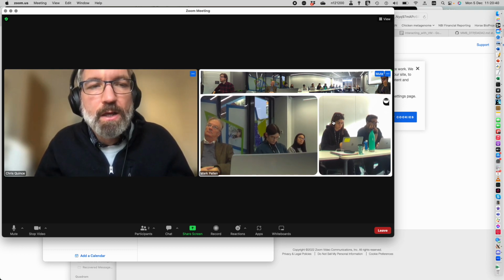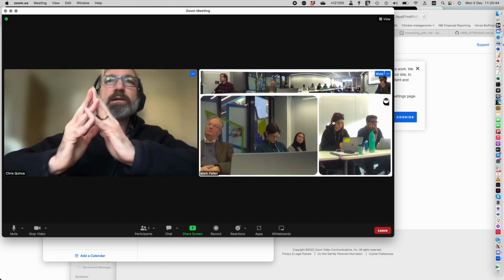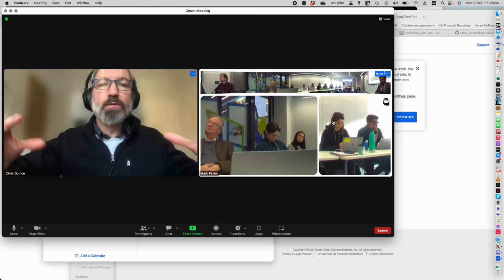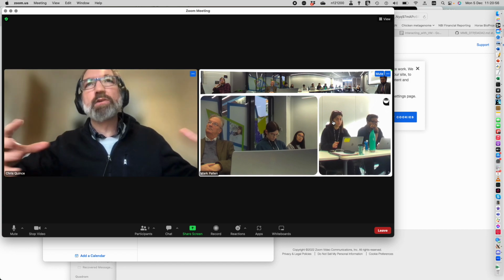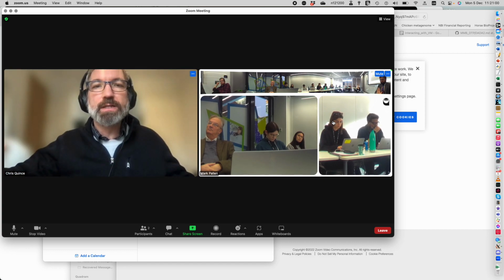Now, what the ASV proposal is, is that we get the maximum resolution by not grouping anything once we've removed noise. When people weren't removing noise, it was like, well, we have to do some grouping to try and reduce the overall noise level.